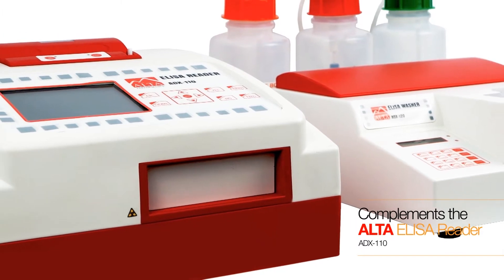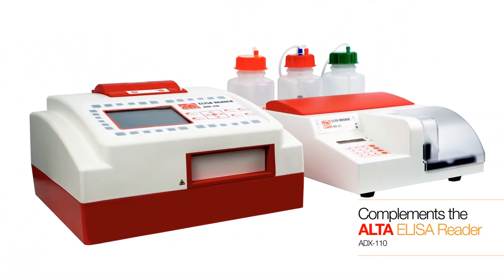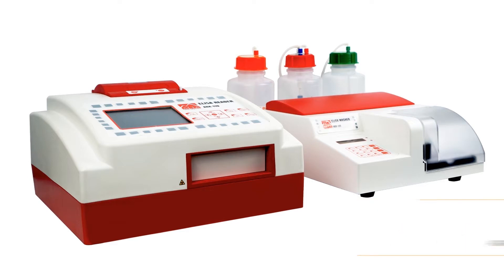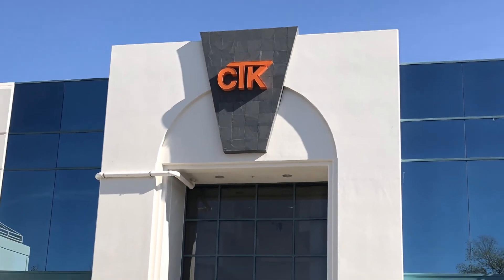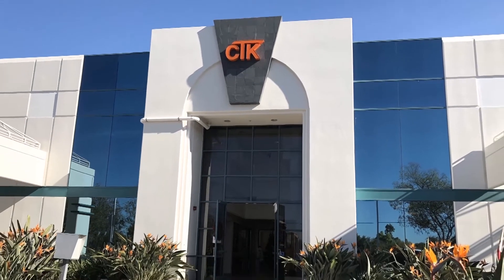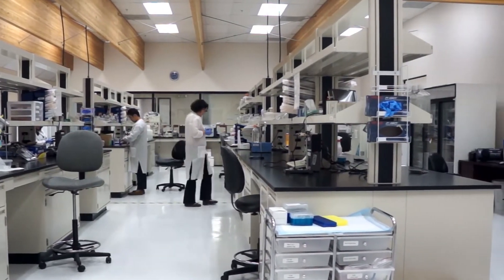CTK's Alta Microplate Washer complements the Alta ELISA Reader, giving you a reliable and cost-effective ELISA workstation. As a medical device manufacturer with ISO-certified facilities, CTK Biotech offers high-quality clinical and research instruments to fit the needs of any laboratory.